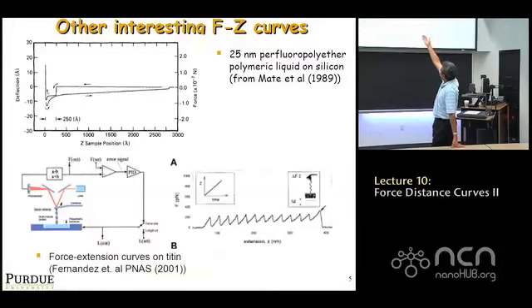What you've got along the y-axis is not the force, but cantilever deflection. But that's okay. To get force, you just multiply cantilever deflection by the stiffness, okay? So, effectively, the y-axis is the force. So you've got force Fz. Try to interpret that for me, if you will.